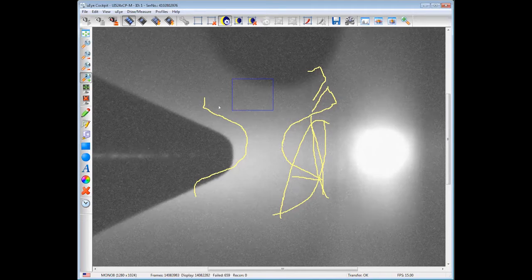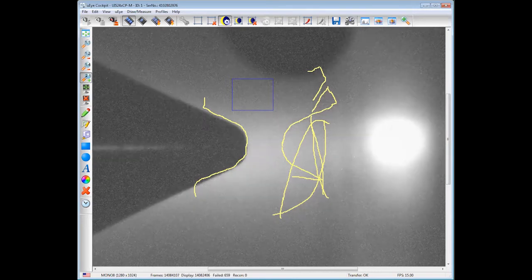Here we usually make some marks, because sometimes there is not enough light inside when you approach with the sample. Okay, so you see now it's in proper position, copying the marks which we made before when we did some measurement.